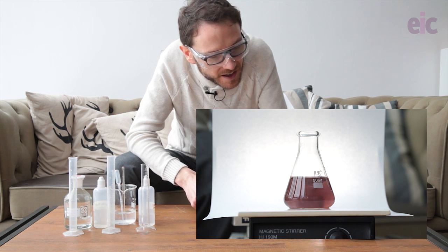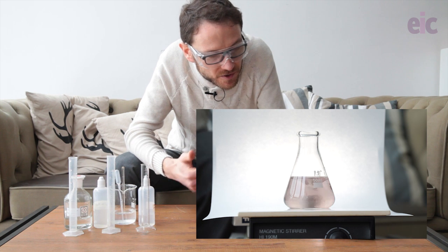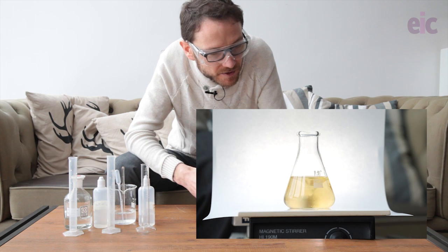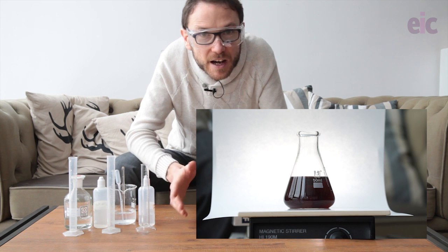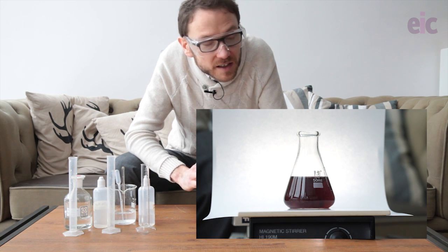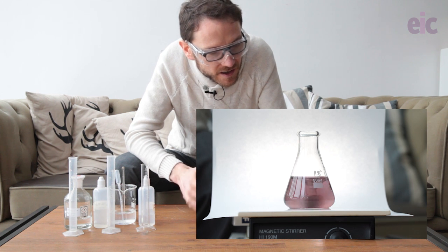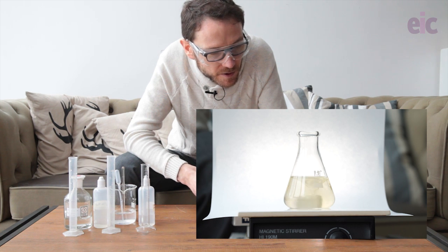And there it is. During this time the malonic acid is reacting with the iodine, flipping the reaction back in the other direction. Once the induction period is over, we get fast switches between the starch complex, the iodine and iodide, and our colorless solution where we have very low levels of iodine and iodide.